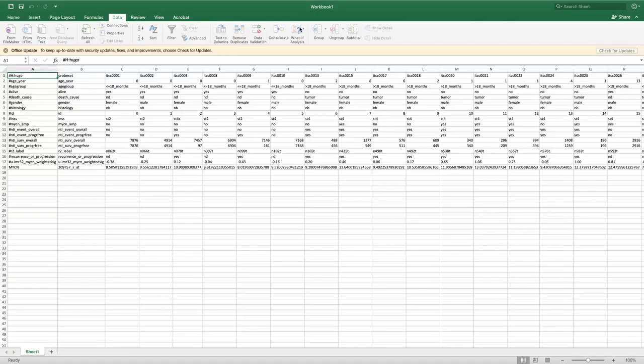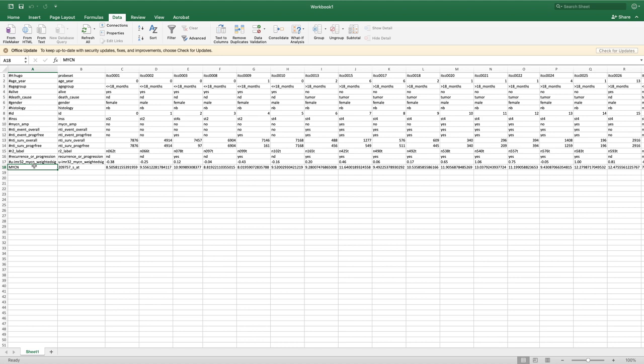Simply right-click this file and save the link, which you can save anywhere - to your desktop or any folder you'd like. Once you've downloaded the file you can open it in Excel, and what you can see is that you have sample IDs, all of the different sample annotations available for this dataset, and the log2 values associated with MYCN for each sample in the dataset.